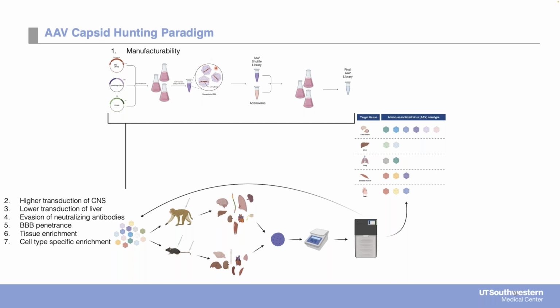In this first round of purification, we harvest what we call our shuttle virus. This AAV shuttle virus is then used in a second round of co-infections with adenovirus to produce our final AAV library. We're able to titer the shuttle virus at a low MOI so that we can target 1 viral particle per cell. This is to avoid any sort of mosaicism that could occur if multiple copies of a viral particle infect a single cell.